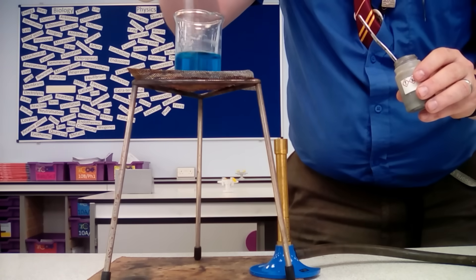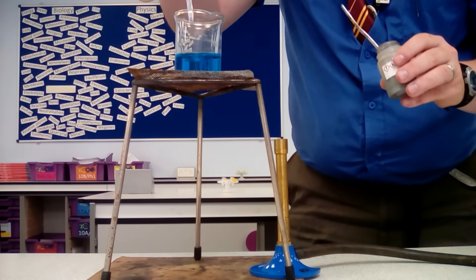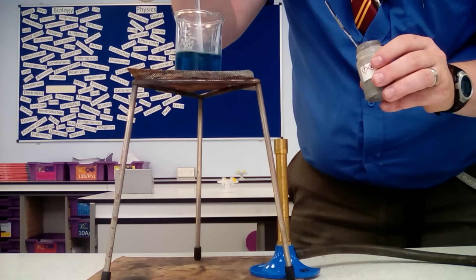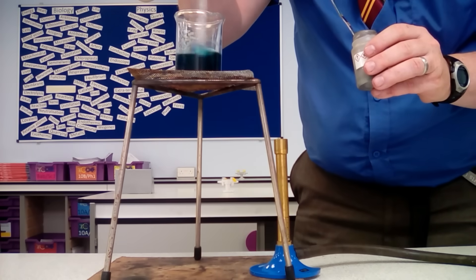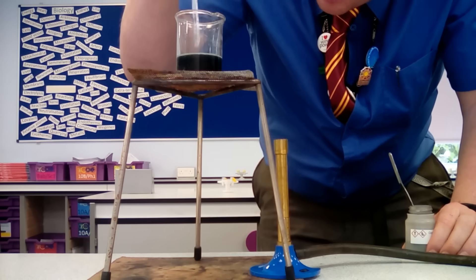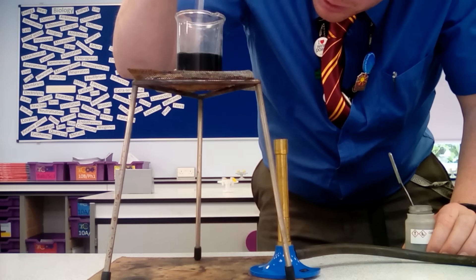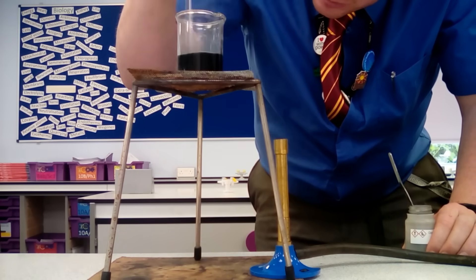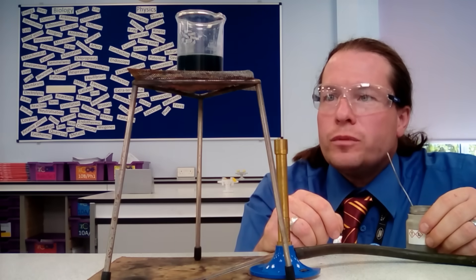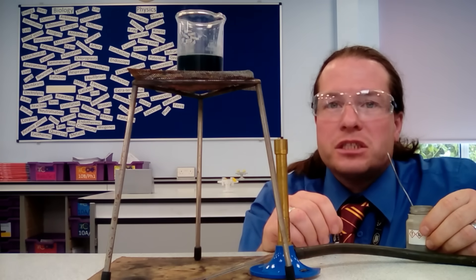We give it a little stir to help the oxide dissolve and add a little bit more, until we get to the point where we've got no more reaction happening and we're left with some copper oxide in the bottom of the beaker. Because of the colour, we can see that no more copper oxide is going to dissolve into our sulfuric acid — we're now at saturation point.